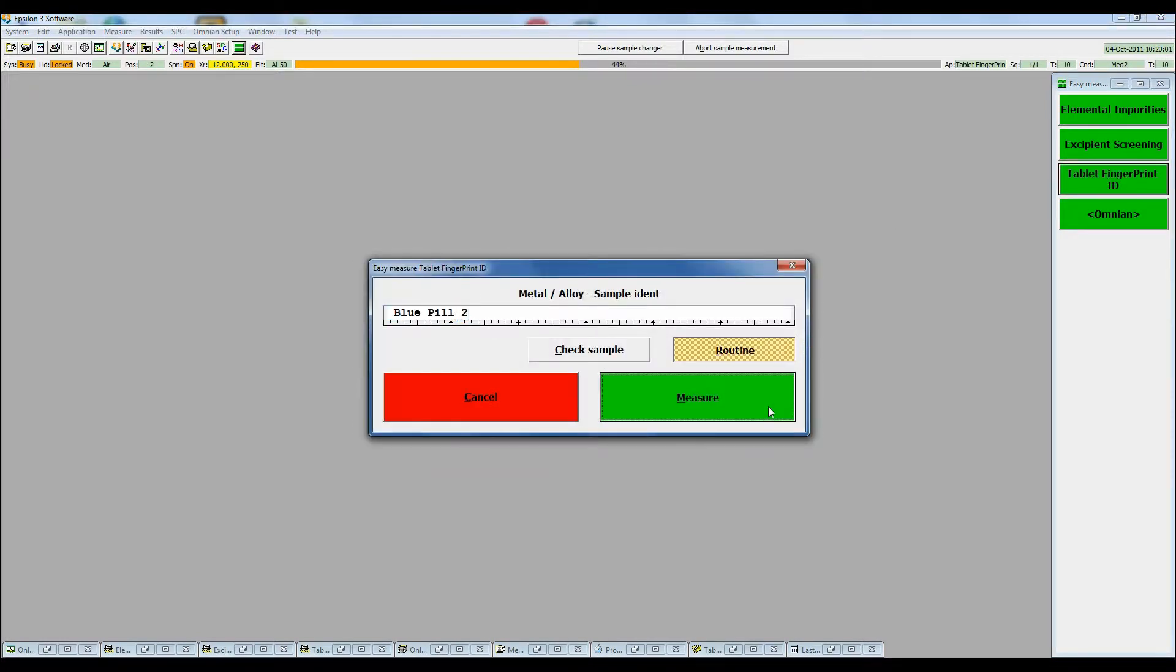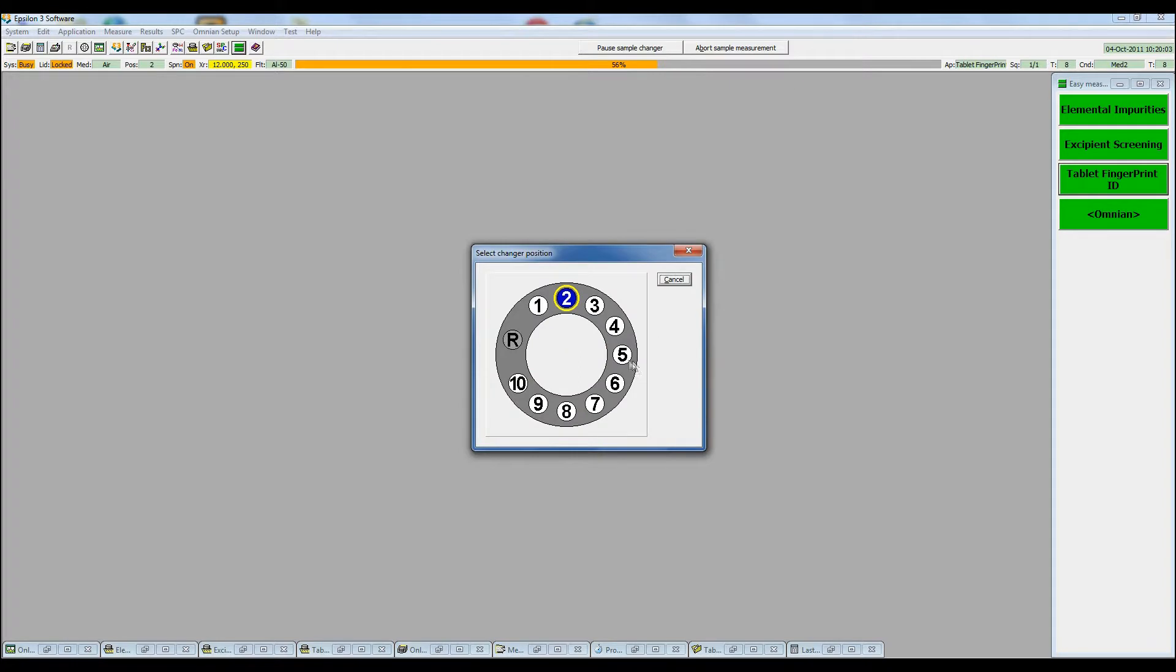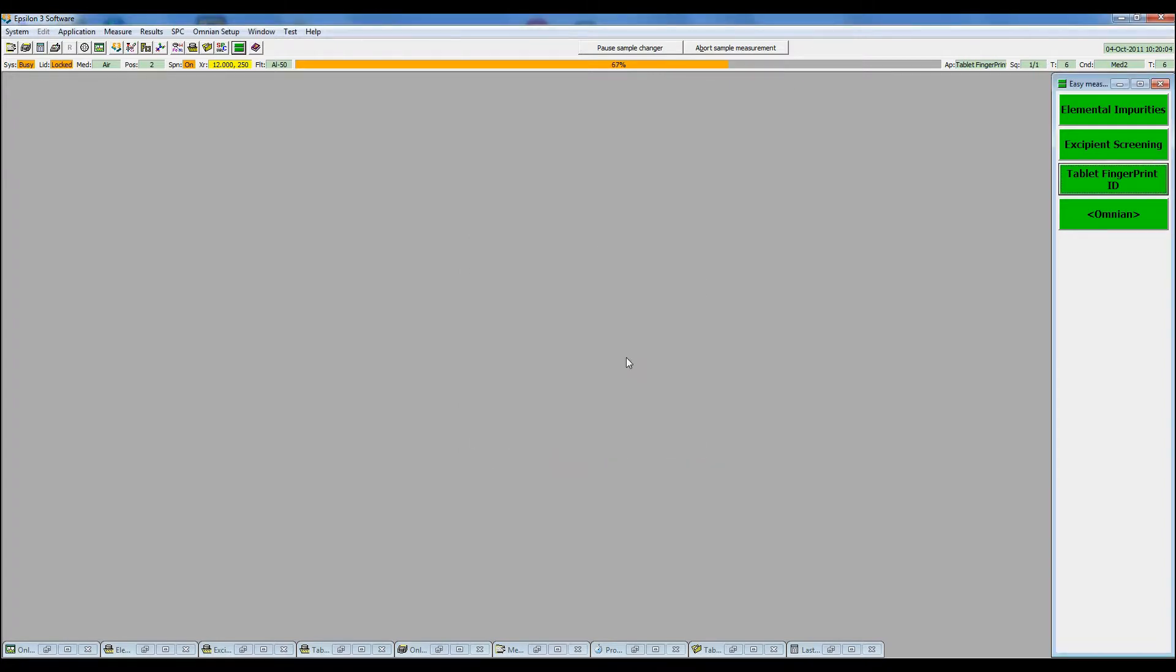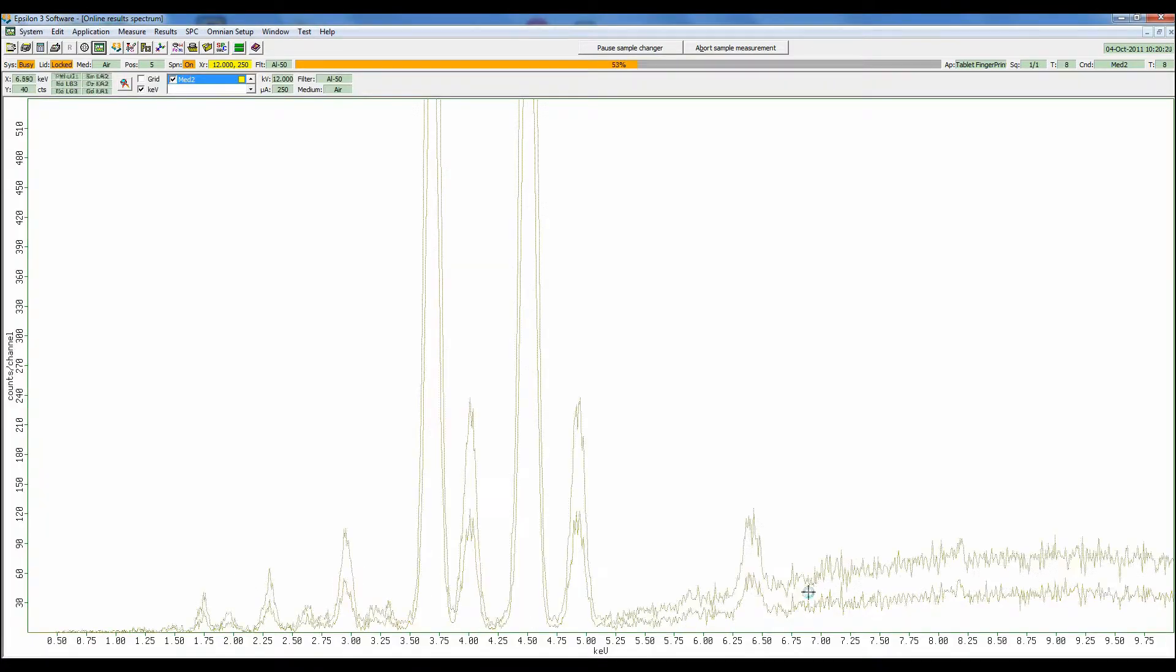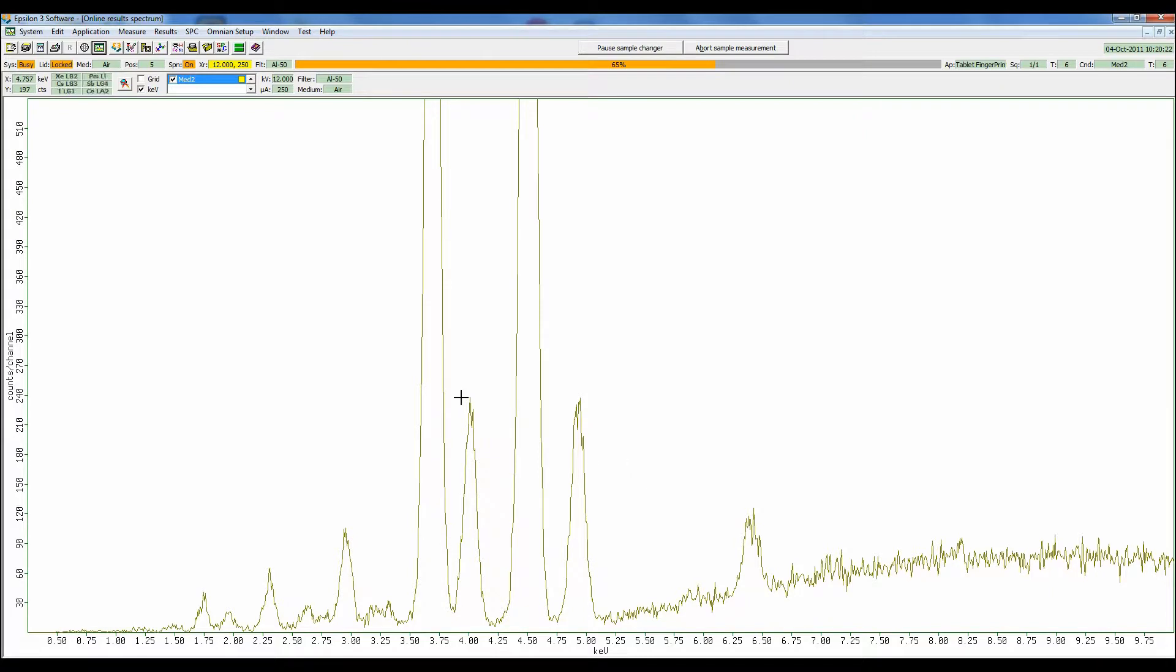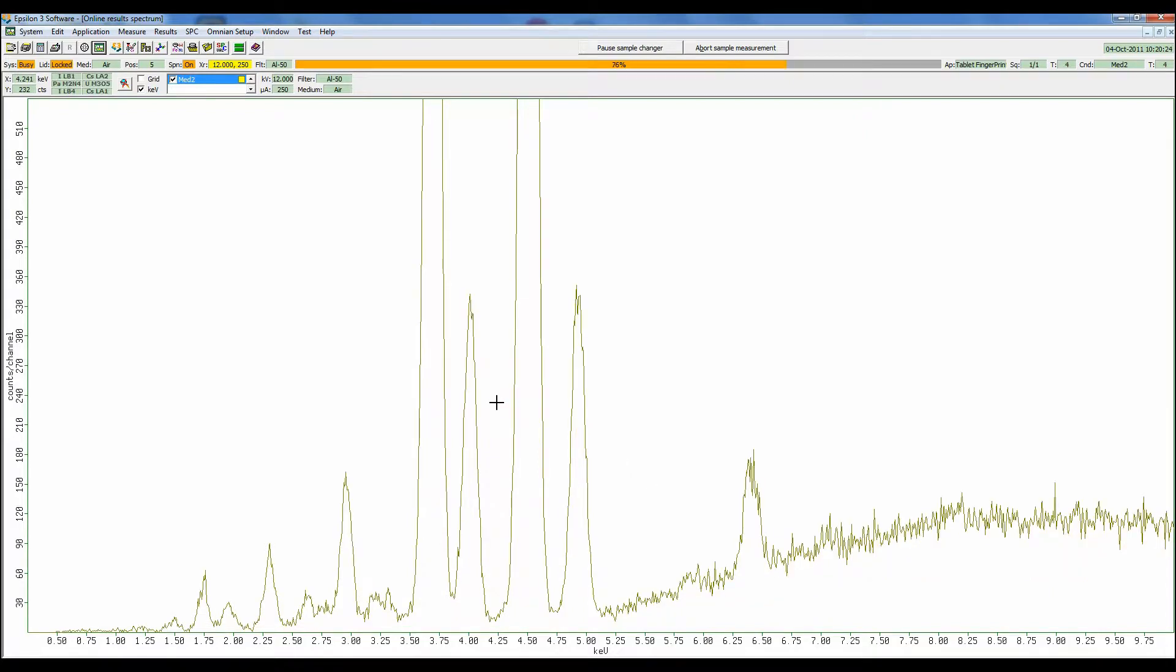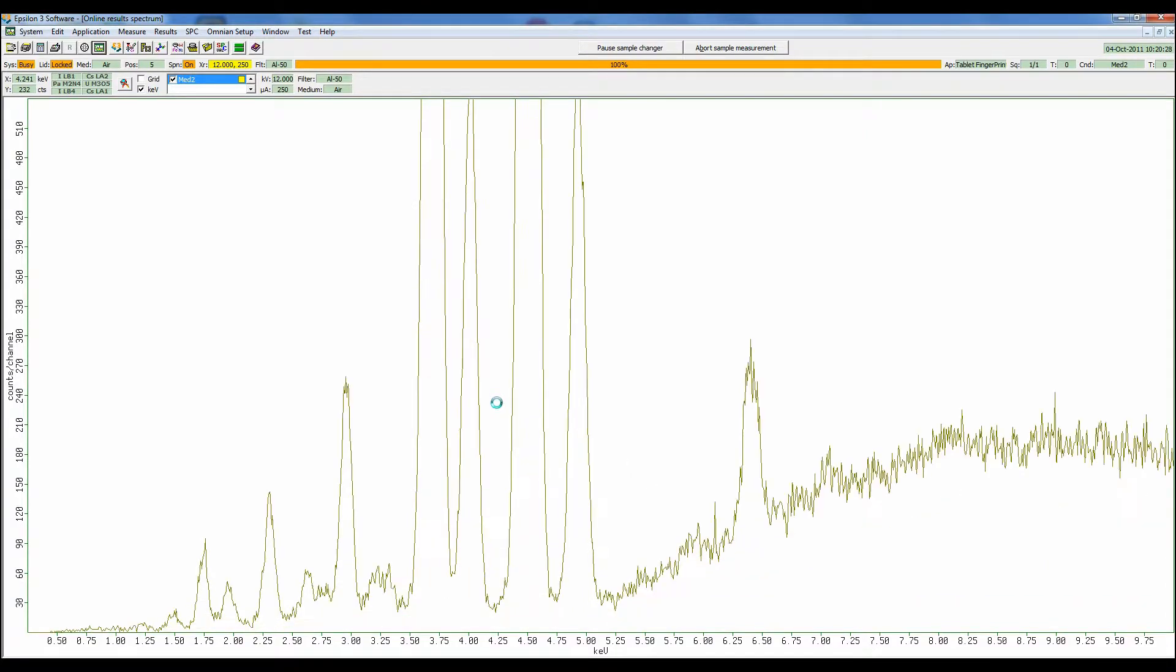Now that our first measurement is completed, we can see some live spectra being collected from our second. Here are some large elemental peaks and some very high count rates.